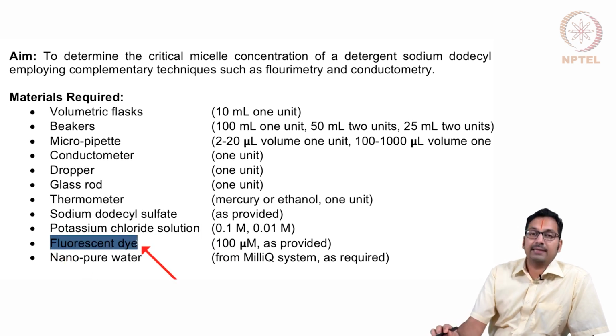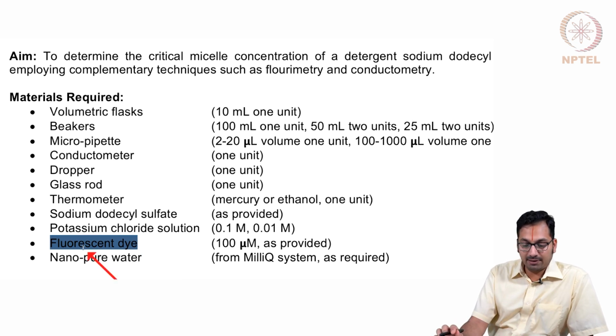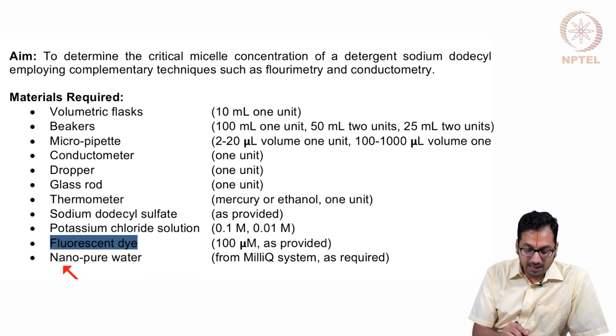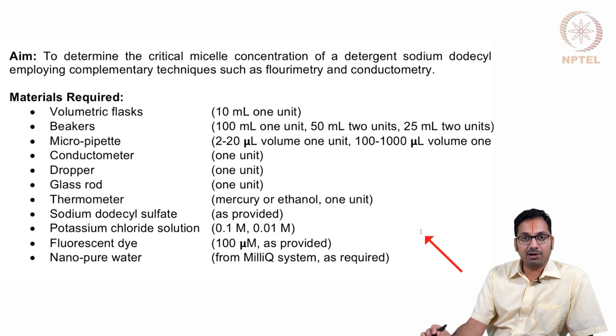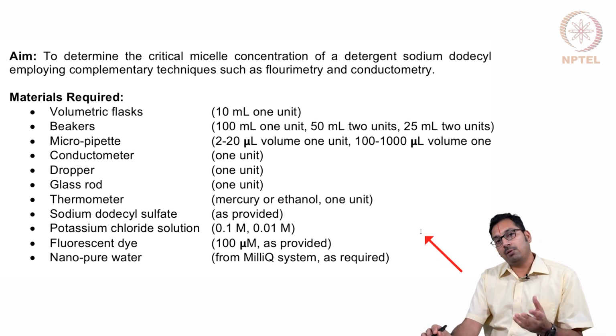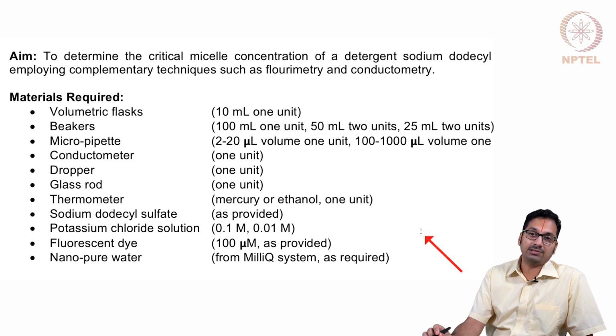And the fluorescent dye, since this is a surfactant that is not inherently fluorescent, in order to perform the experiment you would have to add this fluorescent dye. And of course water, in order to make up the solutions as pure as possible, in order to make sure any contaminants in water do not contribute towards error in your measurement.